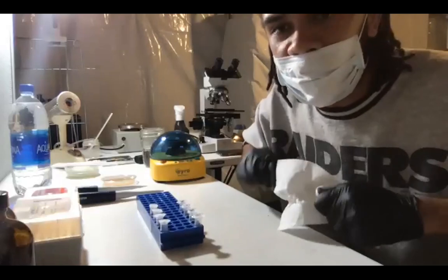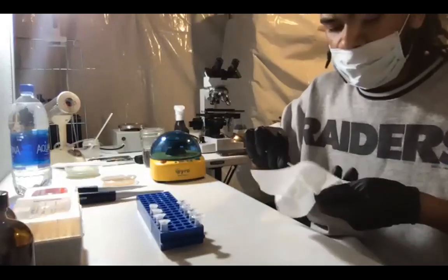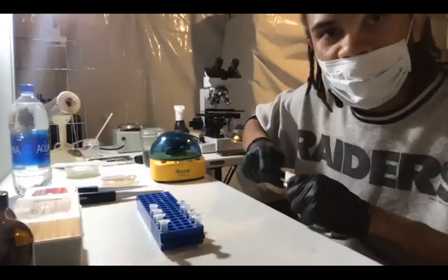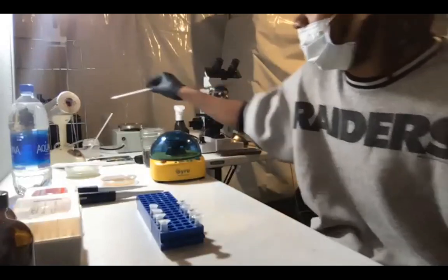And because it's 95 degrees Celsius for 10 minutes, and because I'm getting it so hot, the agar will melt. And this is why you don't want a lot of agar in this solution, because it'll melt and solidify during this process.